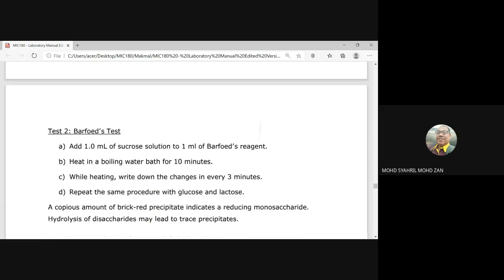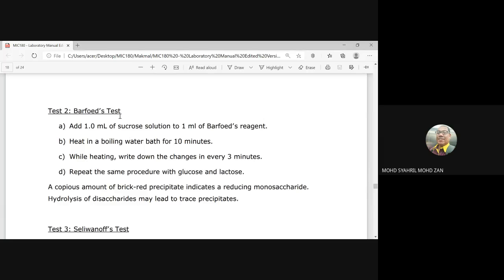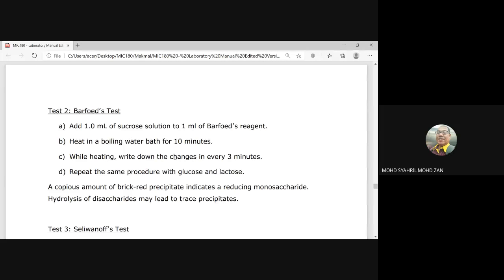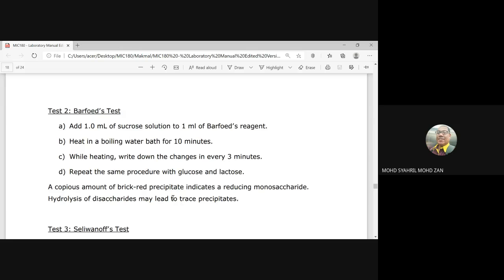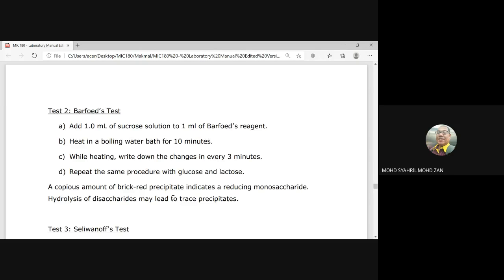Test 2 is the Barfoed test. Add 1 ml of sucrose solution to 1 ml of Barfoed reagent and heat in a boiling water bath for 10 minutes. While heating, record the color changes every three minutes — this is the expected result recorded at each 3-minute interval. Repeat with glucose and lactose. A copious amount of brick-red precipitate indicates reducing monosaccharides. Hydrolysis of disaccharides may lead to only a trace of precipitate.